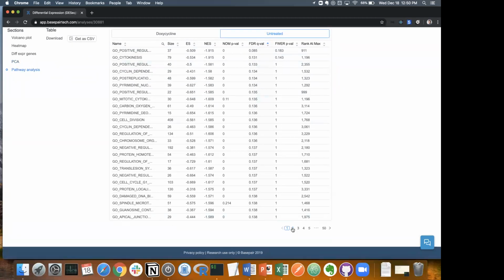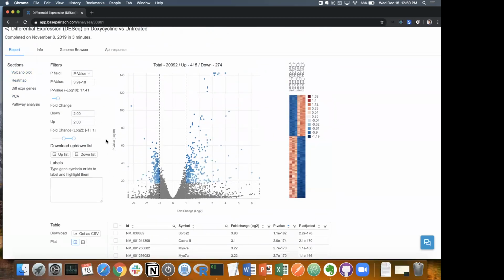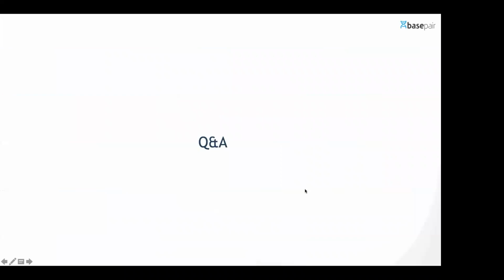So then, yeah, these are all the results, and you can click it and go through it all, and you can even download it as a CSV if you need to, and it's all there for you. I think that's about it. Yeah, so that's it. And thank you for listening.